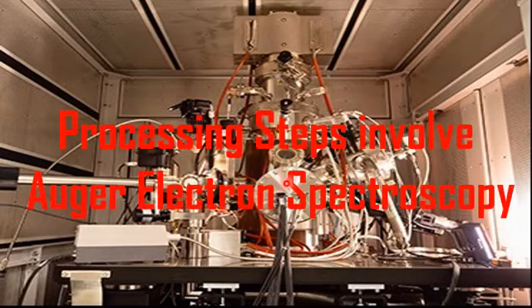Processing steps involved in Auger electron spectroscopy.